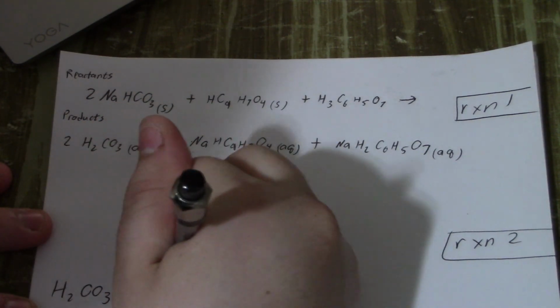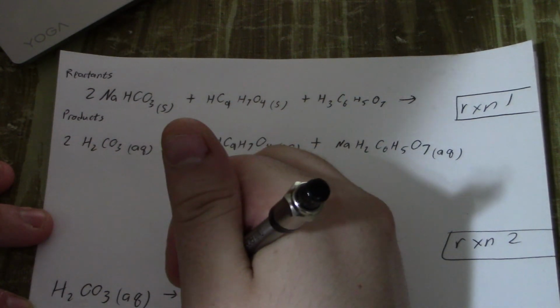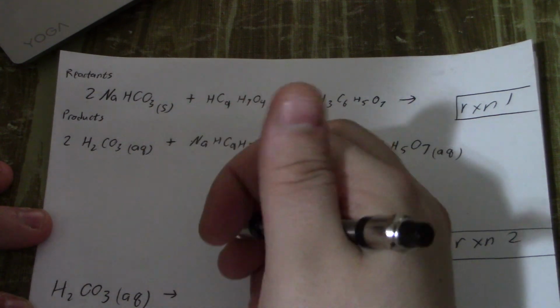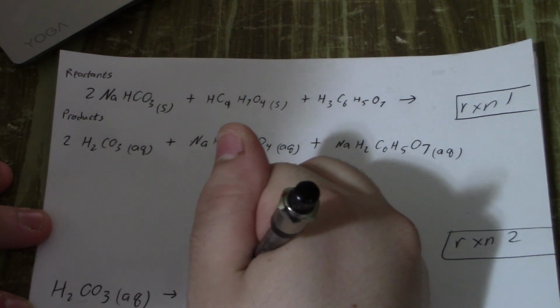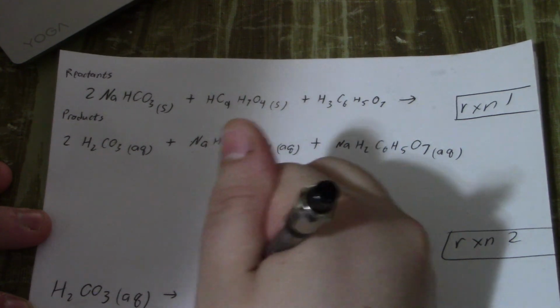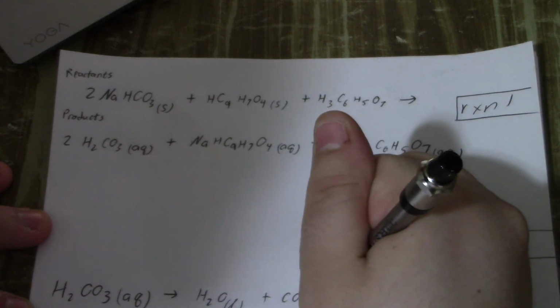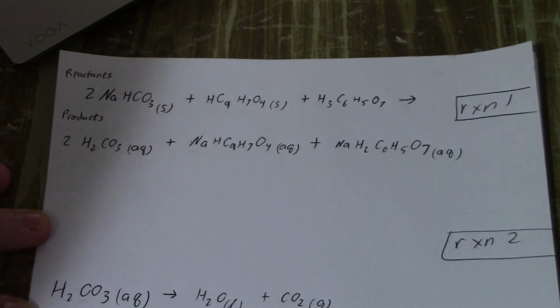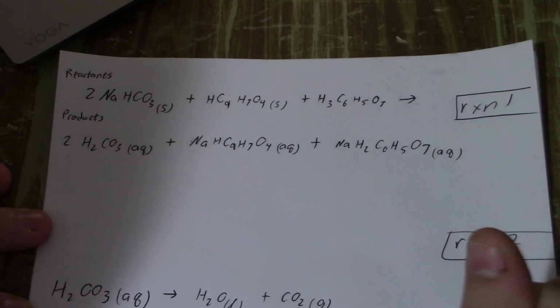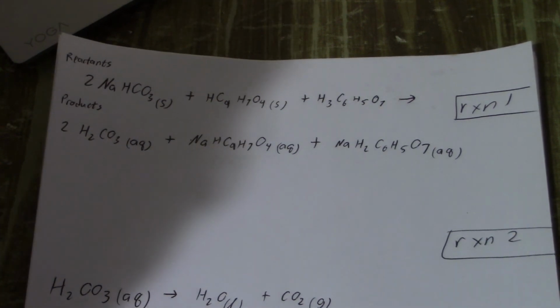We've had many points to practice this decomposition of carbonic acid. It's the main example I give when talking about decomposition reactions. Okay, so next reaction, and then finally reaction 3. Can you guys see down there?